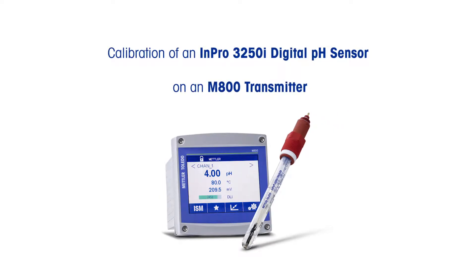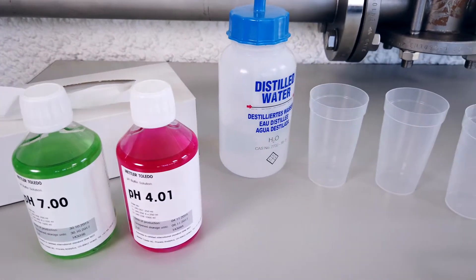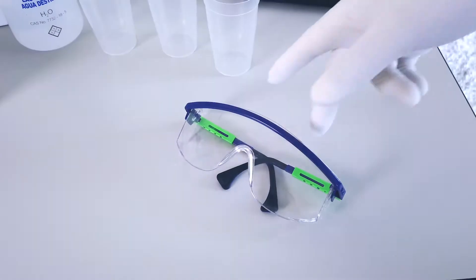Here's how to do a two-point calibration on a Mettler Toledo NPRO 3250i digital pH sensor using an M800 one-channel transmitter. For a two-point calibration use pH 4 and pH 7 buffers.